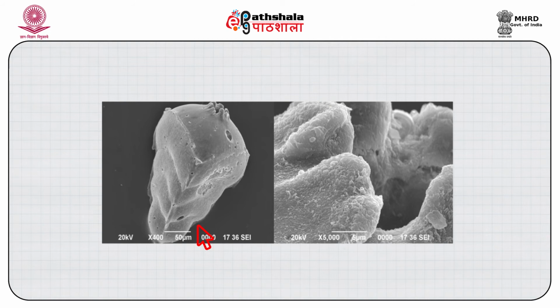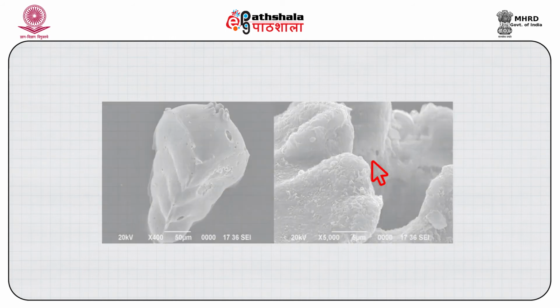In the first figure we see a relatively larger sized image which is magnified in the second diagram, where the marine microfossil is illustrated very nicely, and one sees the distinguishing features of the fossil nicely outlined as a result of the secondary electron image. You can see that this is at 5000 magnification, and one can achieve significantly higher magnification for resolving these images, which is not possible with an optical microscope.